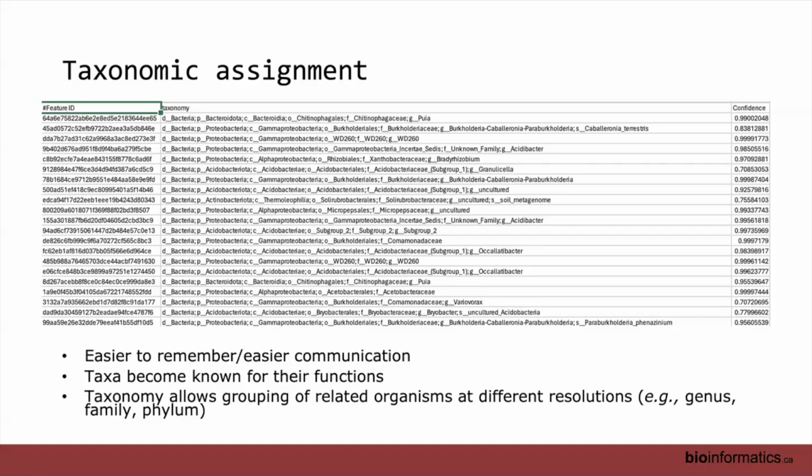It's up to you how confident you're going to require those to be, because each of these tools will allow you to say, if it's below this confidence, then take it up to the next taxonomic level. So you might then be saying, okay, I'm looking at the genus.